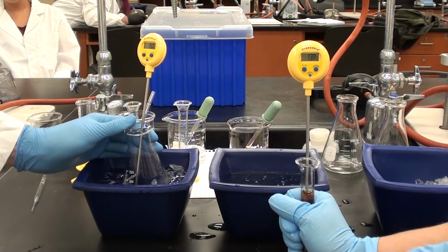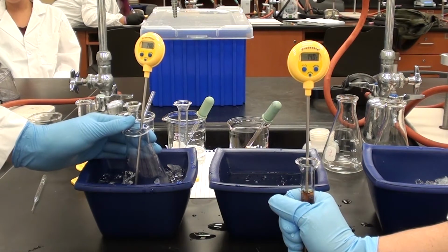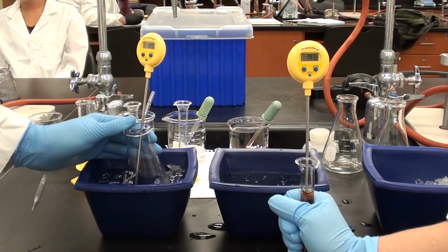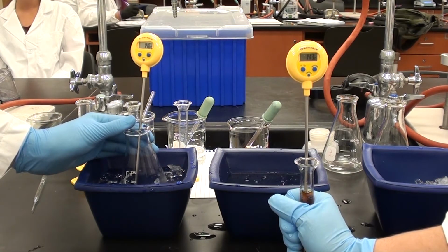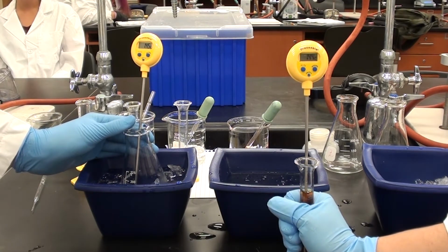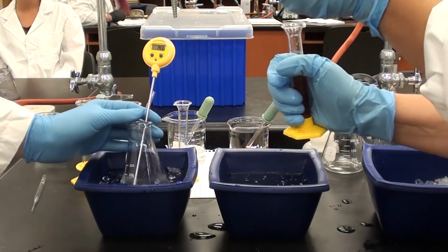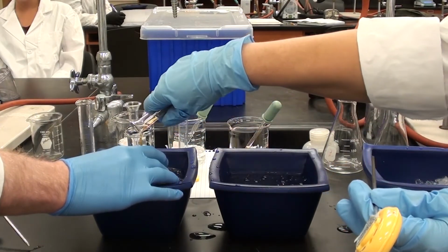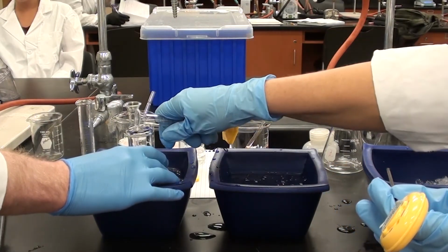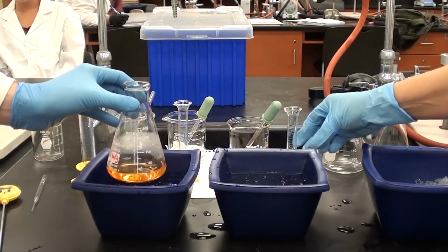Make sure you get your timer ready, because you're going to have to start the timer once they get added together. So that's at 14.6 and yours is at 14.4 and 14.5. Okay, let's go ahead and add them together now. So that'll be the temperature you'll mark down, 14.5 degrees. Now take it out, please, and give it a swirl. Put the thermometer back in.